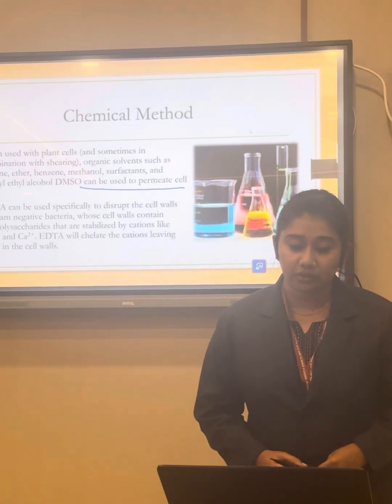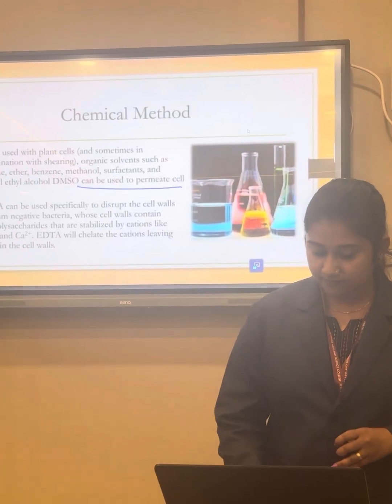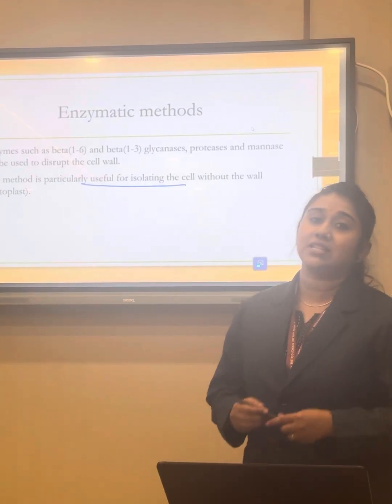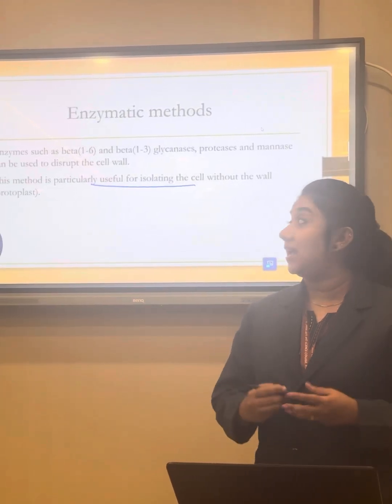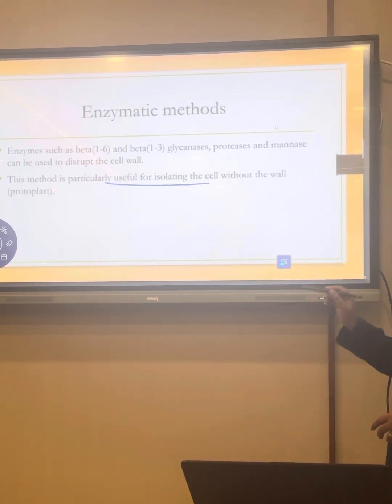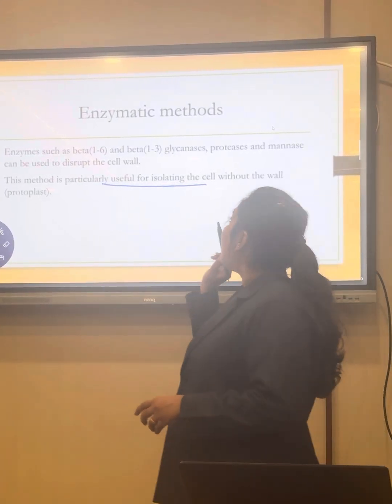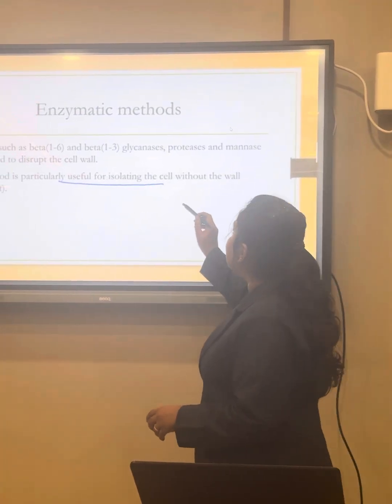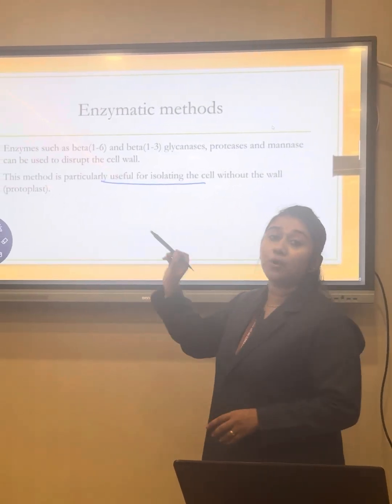Next, moving on to the enzymatic method. In the enzymatic method, we use enzymes to disrupt the cell walls, that is protease, mannase and glycanase. Glycanase means beta-1,6 and beta-1,3. It is commonly used for isolating the cells as protoplasts.